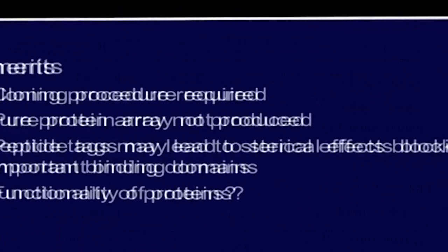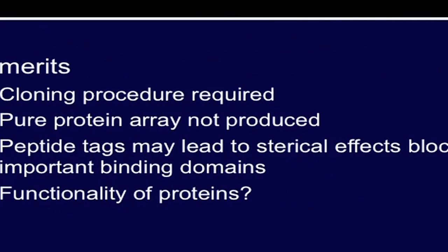Despite several advantages, NAPPA approach also has certain limitations. You need to rely on cloning procedure, which is very tedious, or you may have to obtain the clones from the repositories. There is also concern whether pure protein is produced, because you have printed cDNA on the chip, which is synthesizing the protein. So, there is a coexistence of both DNA and proteins on the chip.